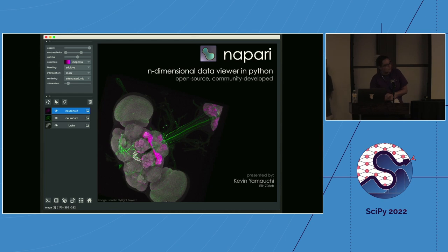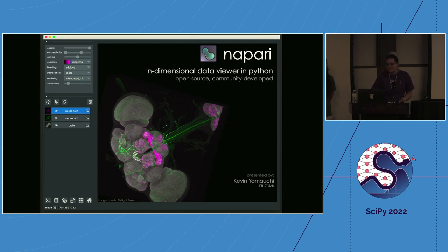Hi, I'm Draga. I'm also a core developer on Napari, and I'm a PhD student in Melbourne, Australia. I'm working on cell tracking, hence my frequent usage of Napari.